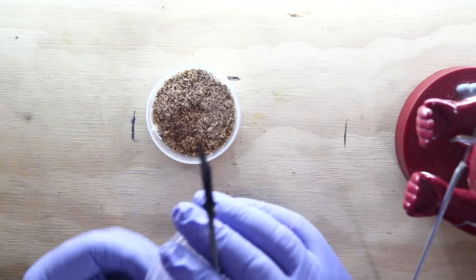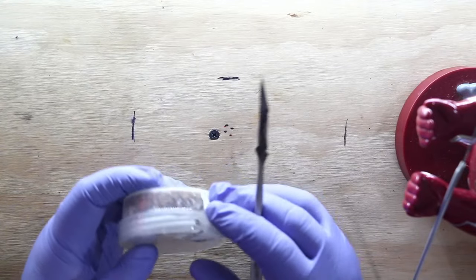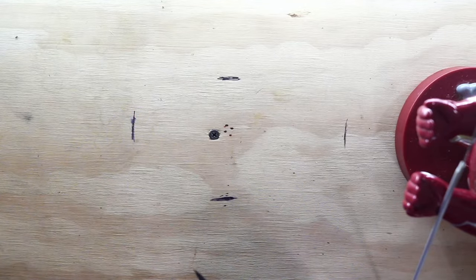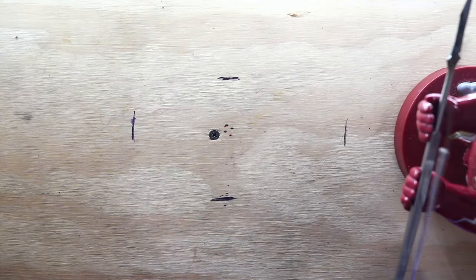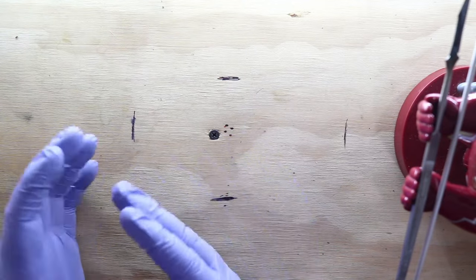Sawdust does not harbor bacteria very well. And most of what we work with works really, really well. It's white rot fungus. It's made to rot down wood and ligneous substrates. And so that ends up being what they call a self-selective substrate. The substrate selects what will go on it. I mean, you should sterilize it because molds and other fungi can grow on it. But you're selecting out for most of the other dangerous stuff, which is bacterial. And even if you have a bacterial sample, sometimes you can throw it in there, roll it around on one side of the dish in the sawdust, and have it grow through, and it's cleaned up.